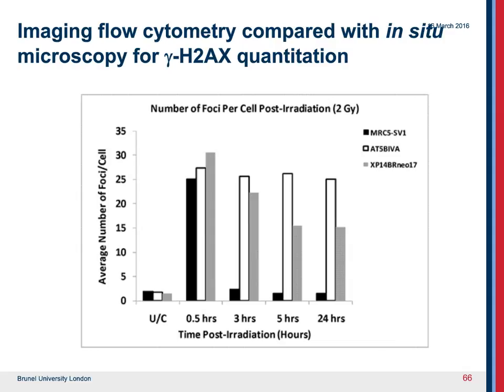So the pattern that we see in this graph is identical to the previous graph that we showed, but if you notice the number of foci that are being identified with in situ techniques, at a maximum we're seeing about 30 foci per nucleus per cell. And that's very similar to the 60x magnification with the extended depth of field. So that's very gratifying. We're approaching in situ levels.